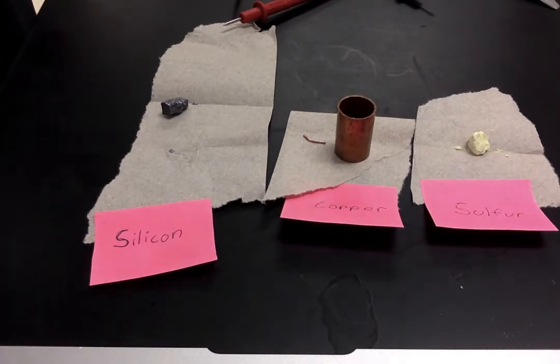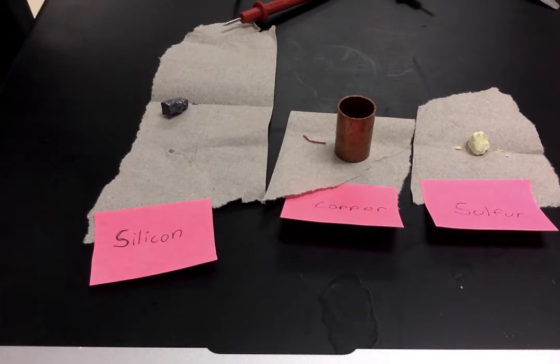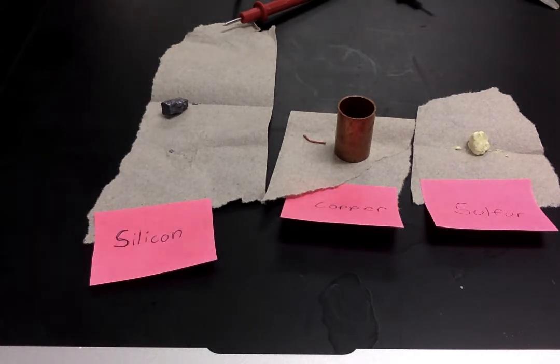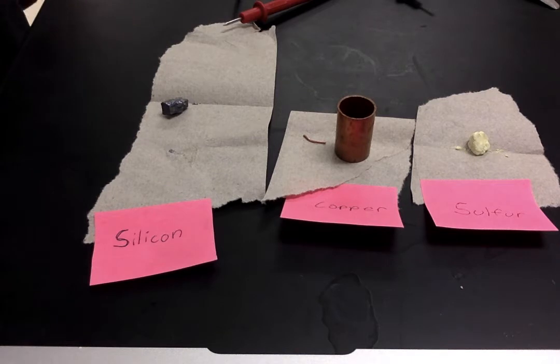Okay, the next thing we're going to look at is malleability. So something that's malleable can be bent into different shapes. The opposite of malleable is brittle. And brittle means that when you try to bend it into a different shape, it just breaks apart. So one of these objects here, you can see I've already shaped it into some different shape.